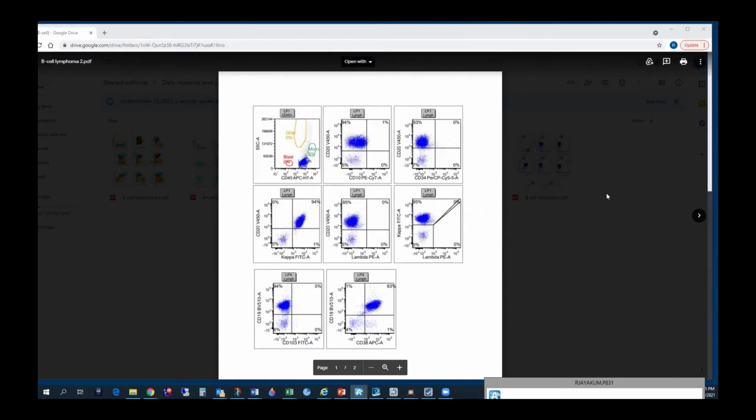Does anybody else have anything to add? 20% of cells being positive in order to call it positive, I think that's a standard rule. Yeah, I heard that too, but we are not using it. Right now I'm at VCU, and we never called anything positive just by 20%. We called it partial. We never implemented that rule. Even if it is at the margin, where you can clearly say 20% of that population is positive, they still said partial.